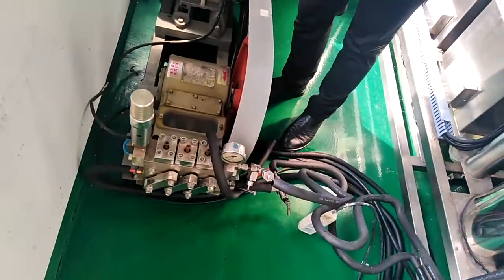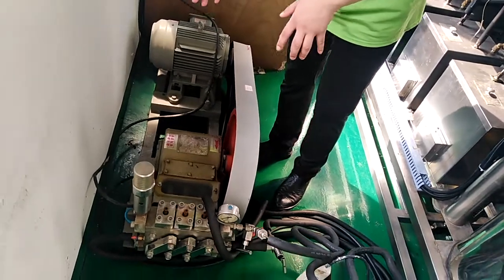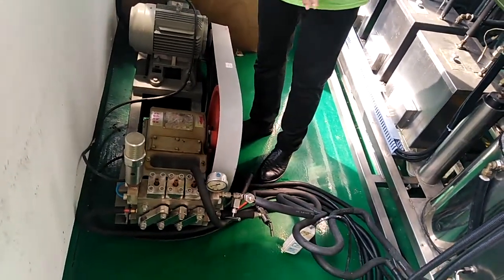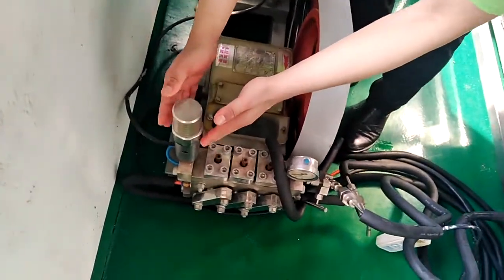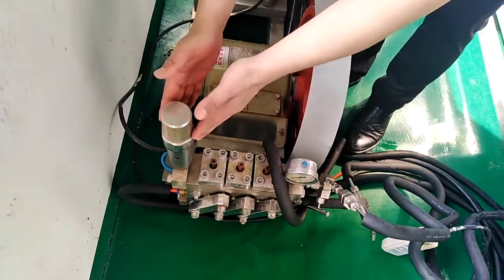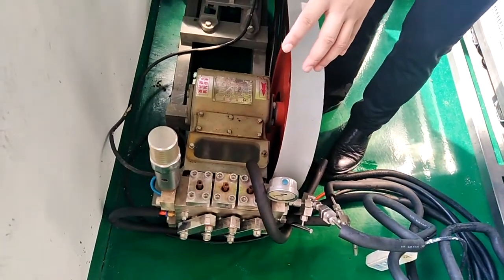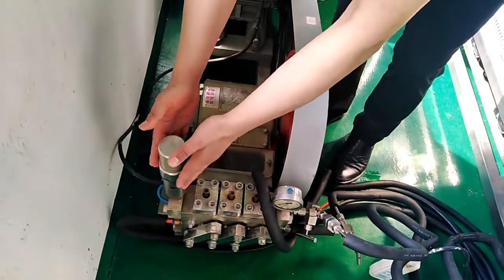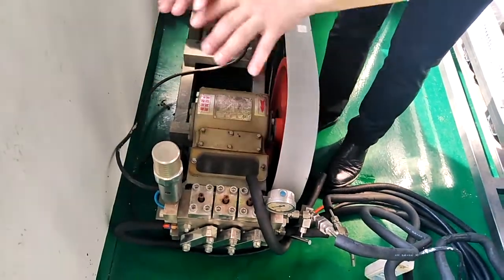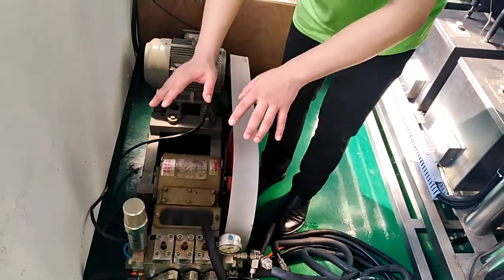This is another main part. It's a CO2 high-pressure pump to provide the high-pressure CO2 for the main body. And here is a key component — a safety valve for safety protection. If the running pressure is over the upper limit, this will work. It will relieve the pressure itself, to keep the whole system, especially the CO2 pump, safe.